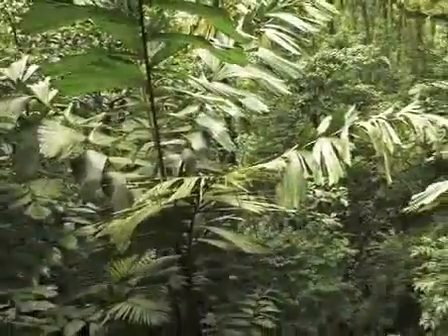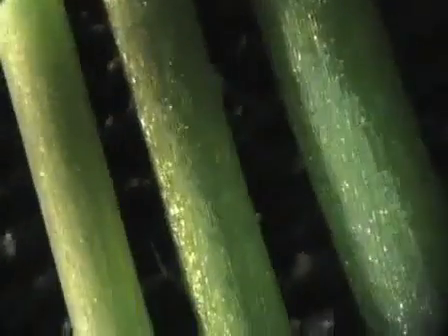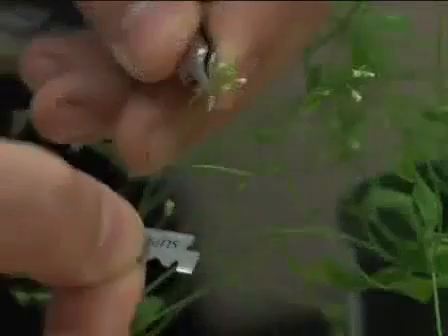Because the cuticle is an essential adaptation of plants to a terrestrial environment, understanding the genes involved in plant cuticle formation has applications in both agriculture and forestry. Today we'll show the analysis of plant cuticle mutants identified by forward and reverse genetics approaches.